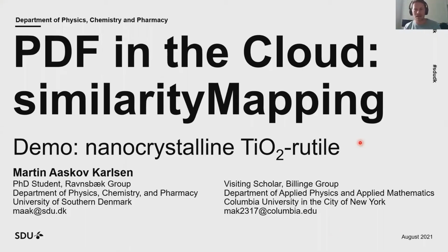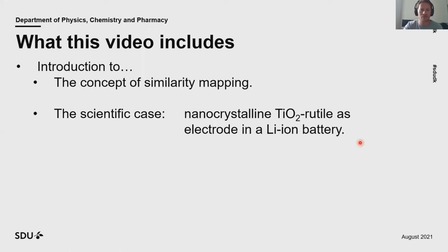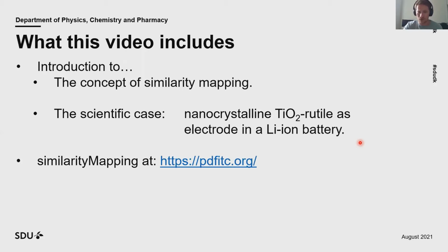Hello, my name is Martin, and in this video, I will demonstrate the Similarity Mapping app at pdfitc.org. I will try to introduce the concept of similarity mapping to you, together with the scientific case for the data I will use for the demonstration. Then we'll go to pdfitc.org and explore the Similarity Mapping app, and then we will interpret the results of this together.